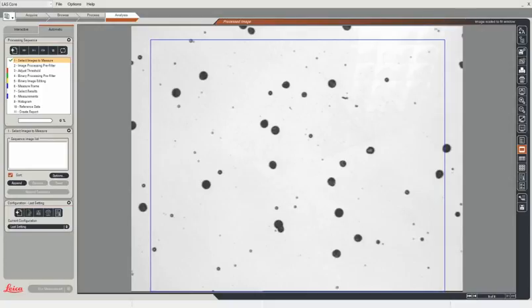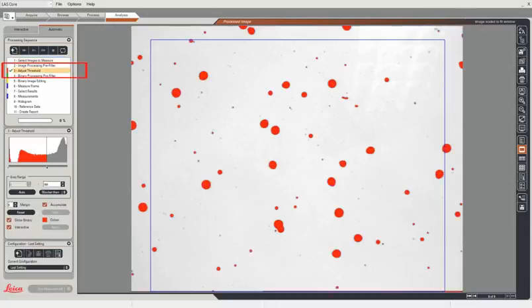The first thing that we need to do is be able to identify the objects in the field we want to measure. We do that by means of the gray level, and I superimpose on top of the image a red overlay that indicates each object that is colored black in the image. When I then go to the measurement step, I can immediately see how many objects I have counted in this field. There are a total of 50.